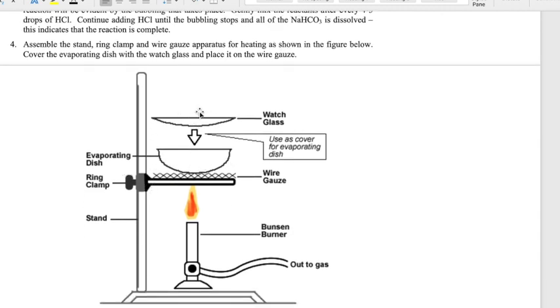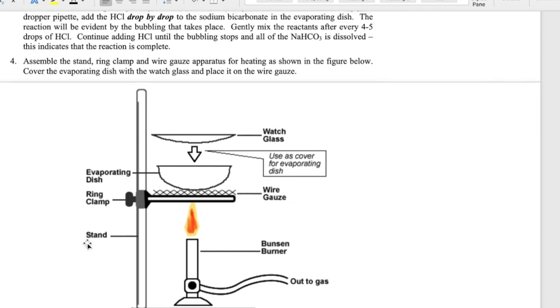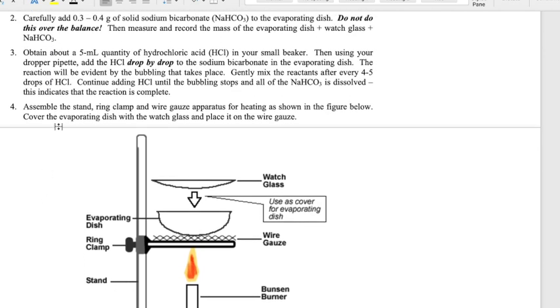You'll have a watch glass to cover the evaporating dish so that when it's heating, the product doesn't splash out and be lost. This is set up on a ring stand with wire gauze over it and a Bunsen burner right below. You'll add HCl drop by drop before you heat — five milliliters in this case — and then start heating.